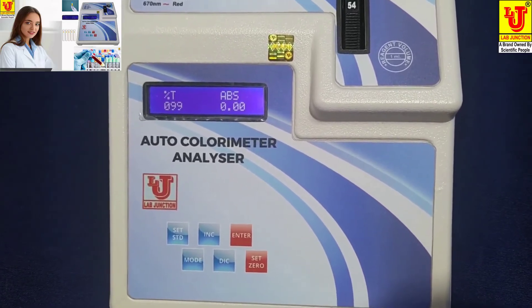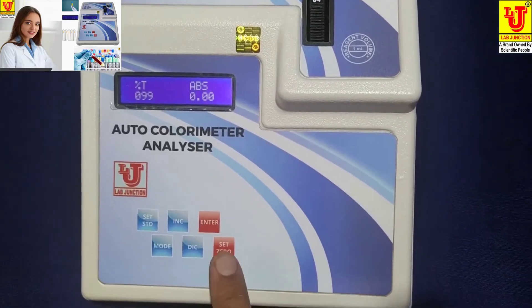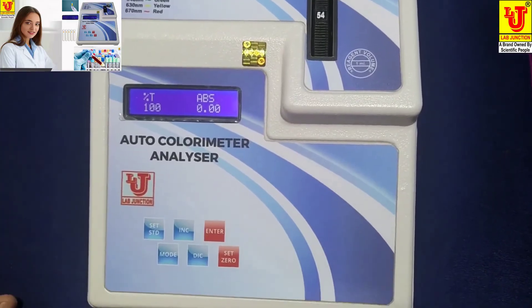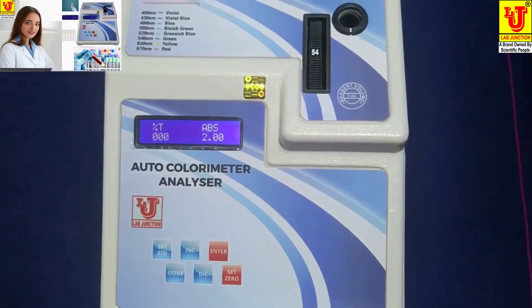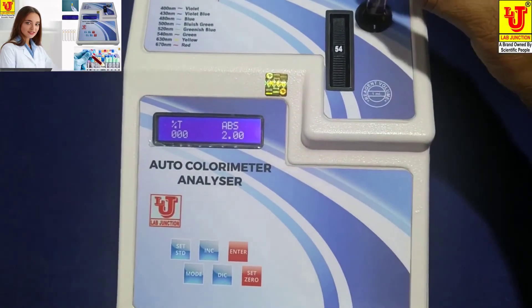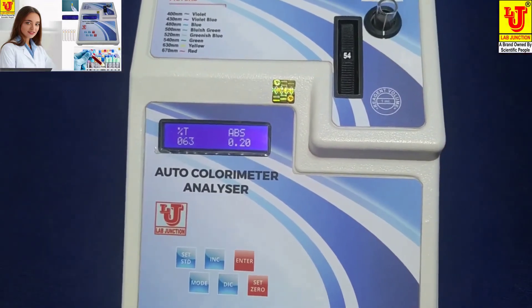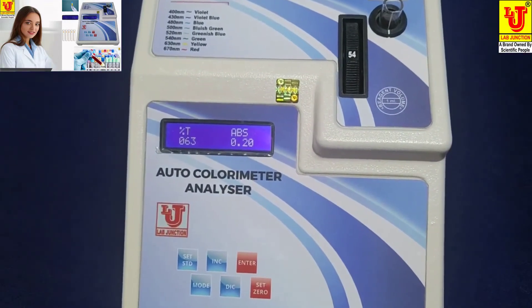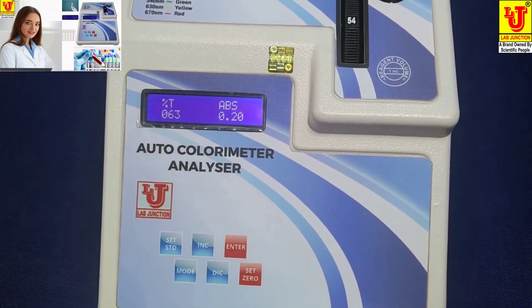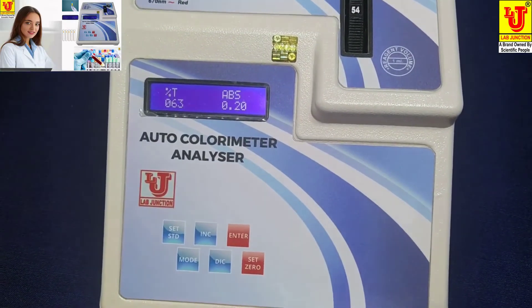Now I am selecting the first display and pressing Set 0 again for blank. This is my sample. With this sample, it shows 63% transmission and 0.20 absorbance.